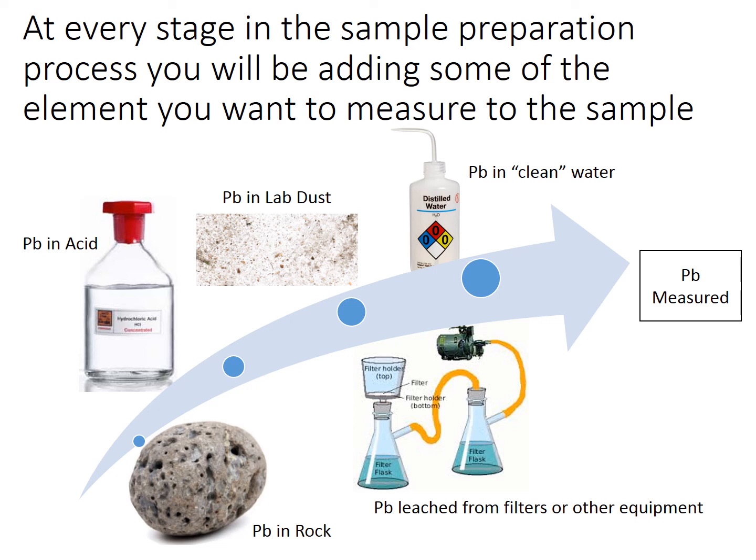If you want to go out and collect a sample, you want to make sure that there's enough of the stuff in the sample that you collect to be bigger than the amount of stuff that you add to it when you process the sample.